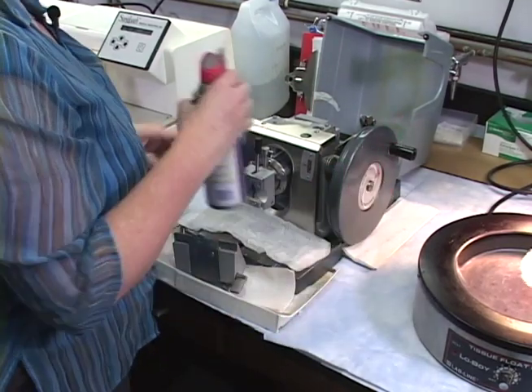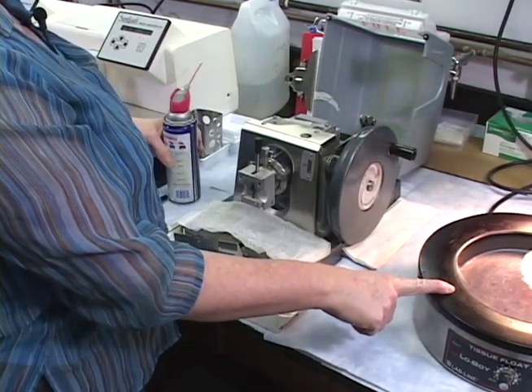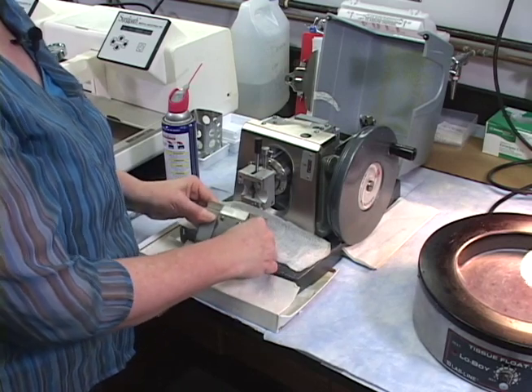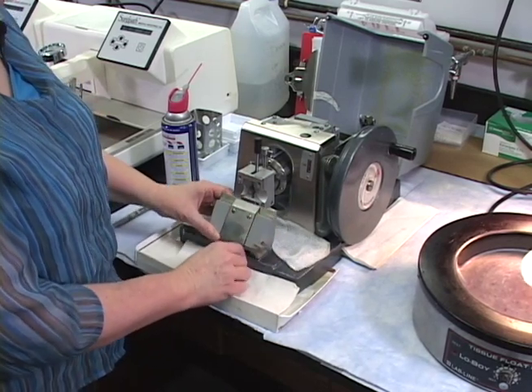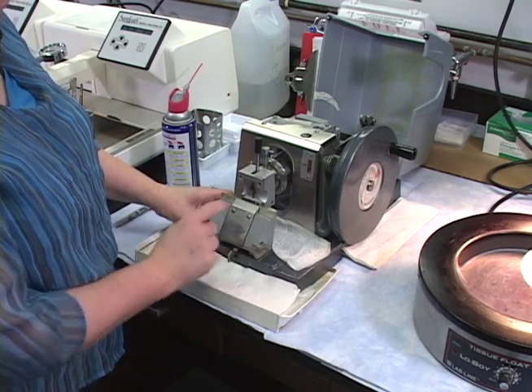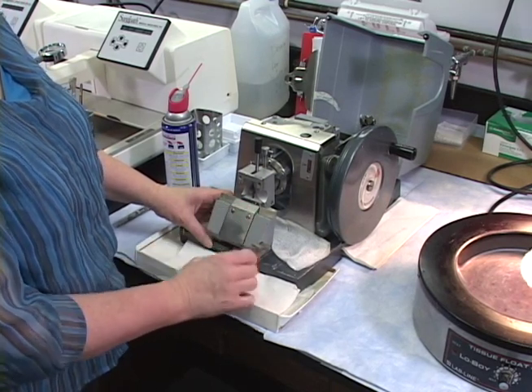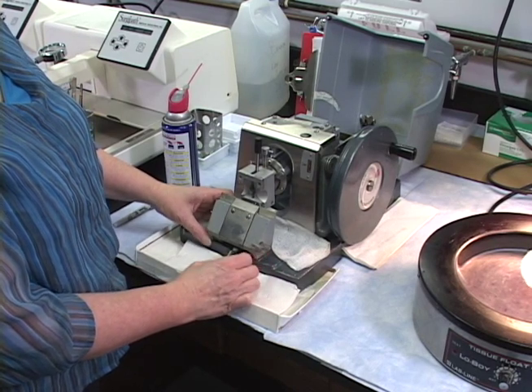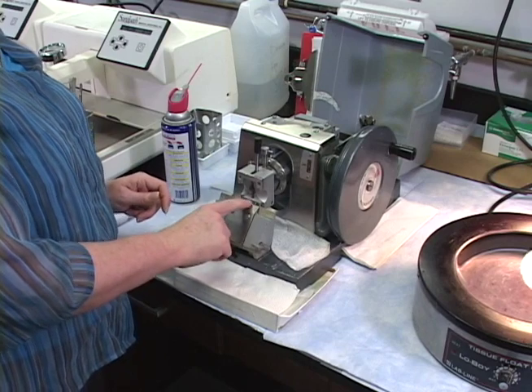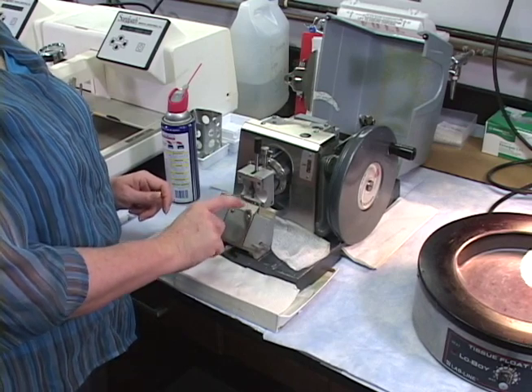I also don't like, you don't want any oil in this water bath, and you do not want any oil on the blade holder itself. If you get oil in the water bath, of course it's going to affect your samples. And if you get any oil on this whatsoever, you won't get a ribbon. It just won't ribbon for you, and it'll be quite frustrating, even with just the slightest bit of oil on this particular thing.